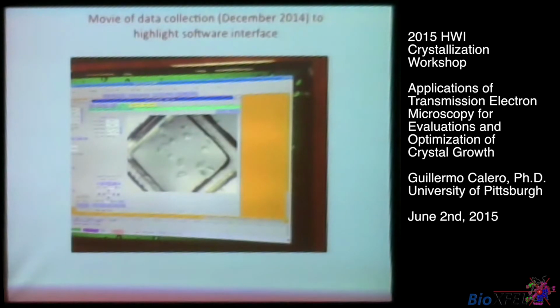So then we actually took this setup and we tested it. I have now already developed the software interface. So we basically took these samples, this is the XPP setup. We gave them a list of the coordinates. They actually read those coordinates and they immediately generated these green rectangles around each one of the crystals. And this is just a very short movie.